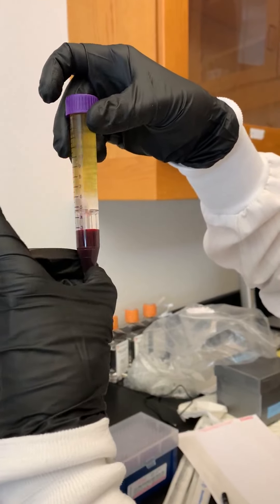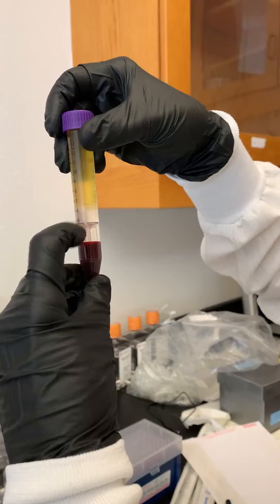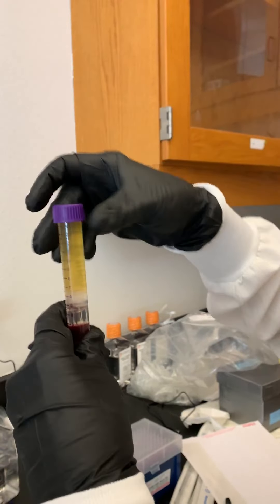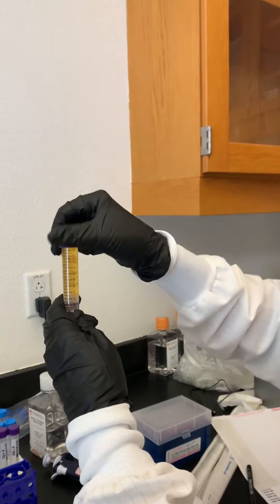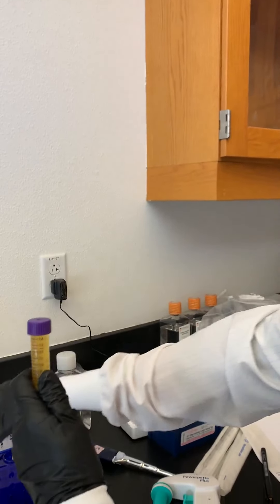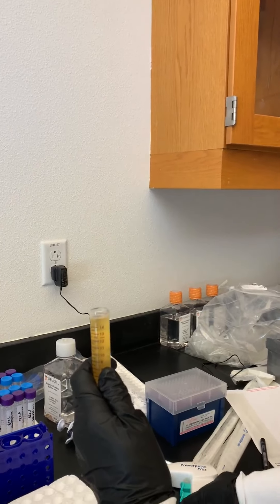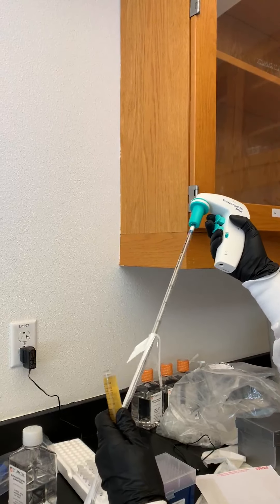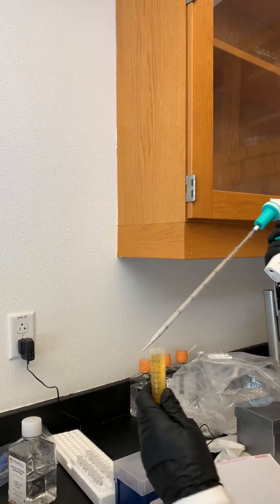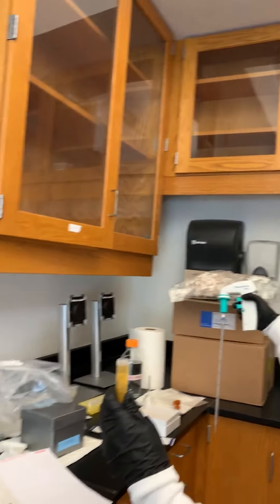So everything else is waste, but we don't want to run the risk of coming too close to this clear layer. Here's what we do — we're going to take our pipette and take off a little bit of this upper volume without disturbing that clear layer. We're going to do that using the auto pipettes. These long pipettes are called serological pipettes and they're located in that box right there at the end of the lab bench.